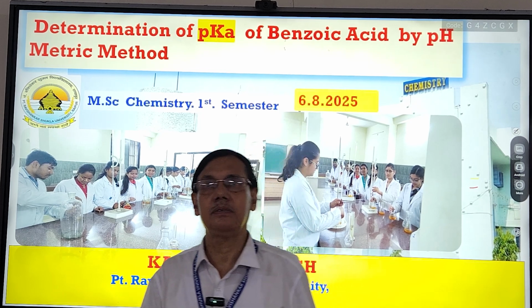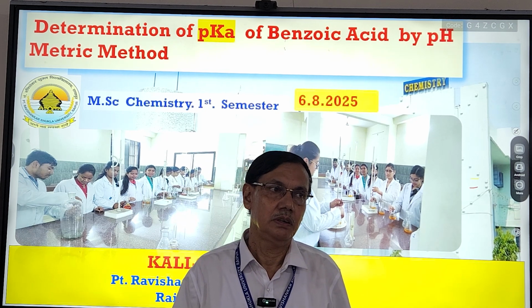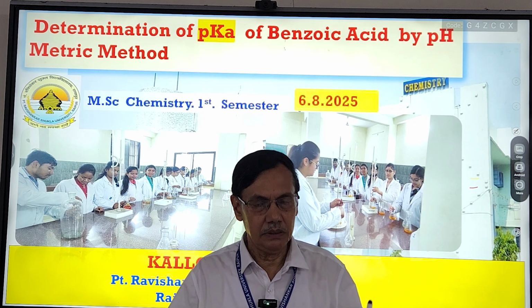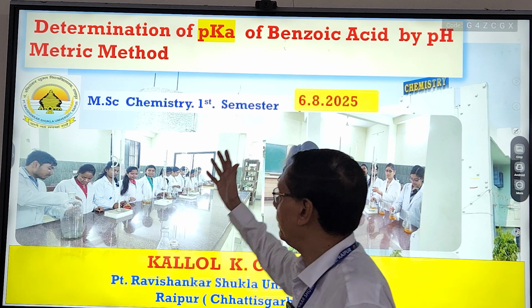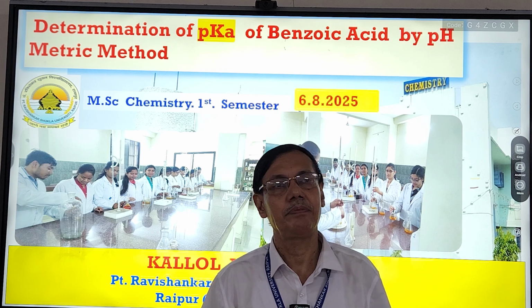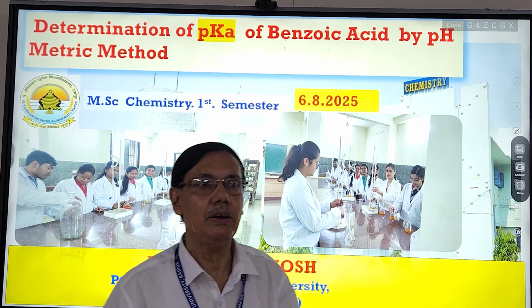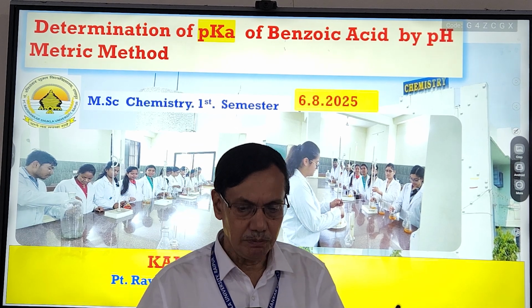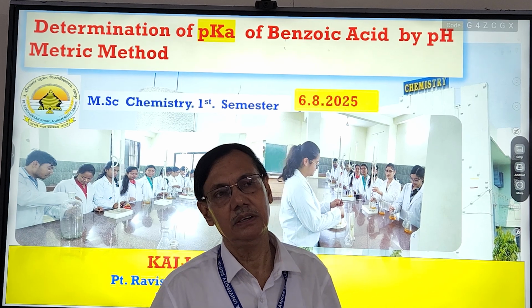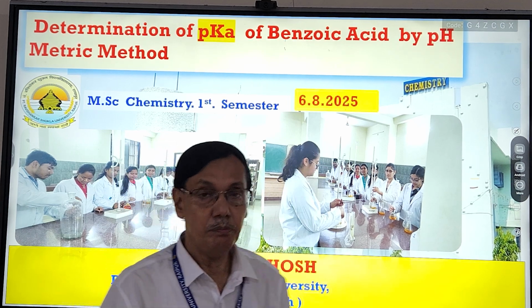As you know, for such a demonstration, we will first discuss the theory and principle of this pH metric method, and in the second part we will perform the experiment, and in the third part, on the basis of your observations, we will determine the pKa of benzoic acid.